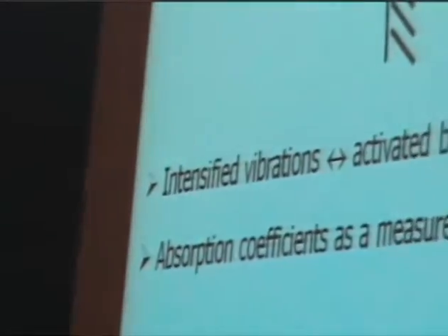It is proportional to the change of the dipole moment during the vibration. And now what does that mean if you, for instance, absorb a molecule at the surface and it starts to react in a reaction that involves a heterolytic bond cleavage? While the molecule absorbs and is being polarized by a site on the surface, then during the vibration we might have a very large charge separation and an elongation of the bond. This is the onset of reaction. On the other hand, it means that at the same time we should have a very large dynamic dipole moment, and this is exactly what we measure with infrared spectroscopy.